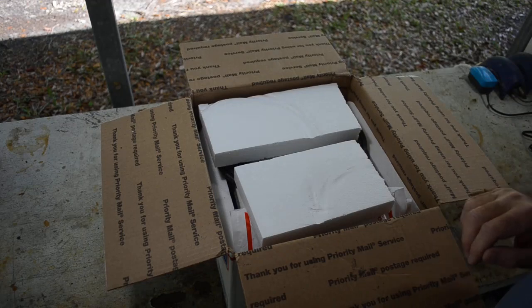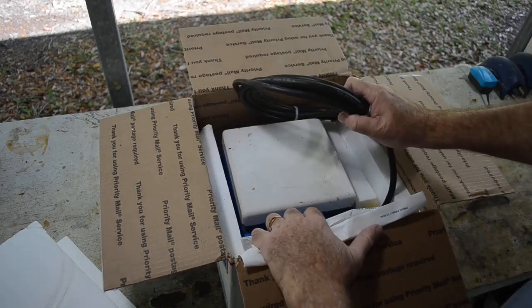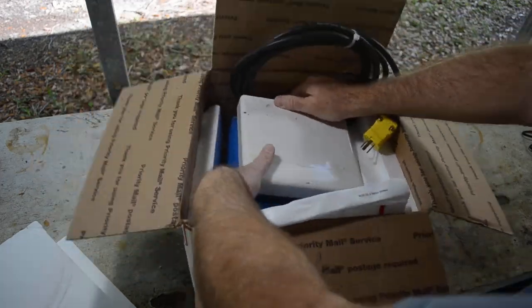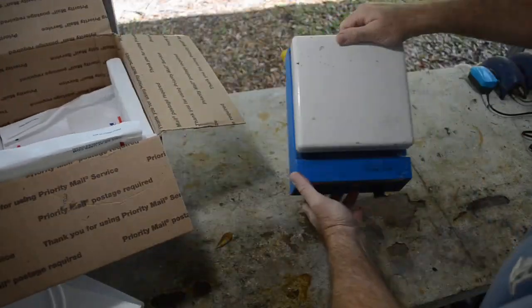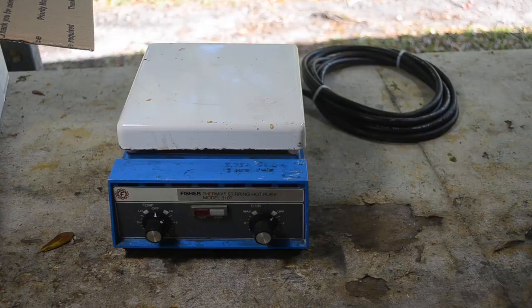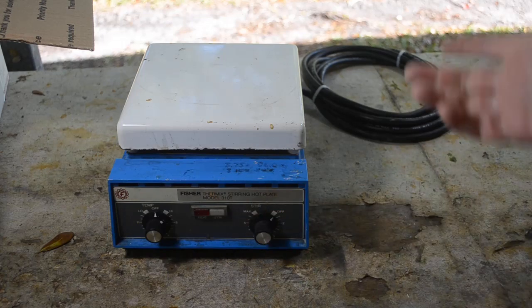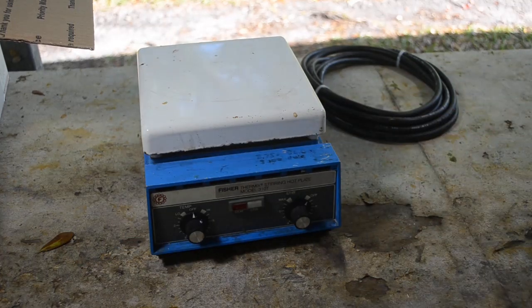Yes, I bought a box full of Styrofoam. The plot thickens — power cord, ceramic top. It's a hot plate with the stir function. It's a Fisher Thermix Stirring Hot Plate Model 310T. And yes, it is used. I got it as a deal on eBay, used. Seller says it works, so we'll see. We'll give it a test.